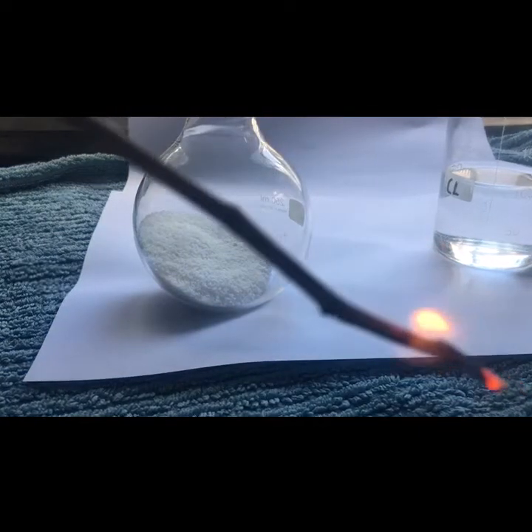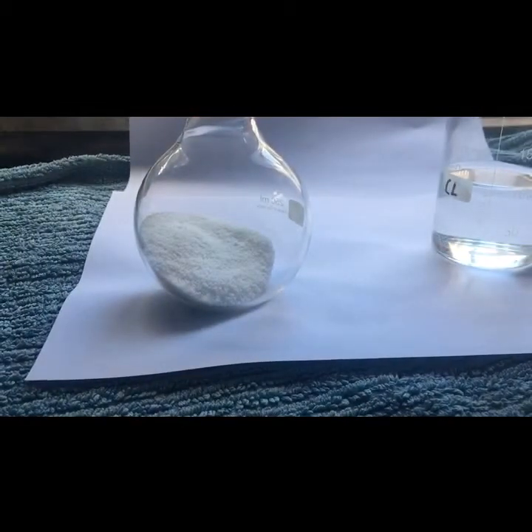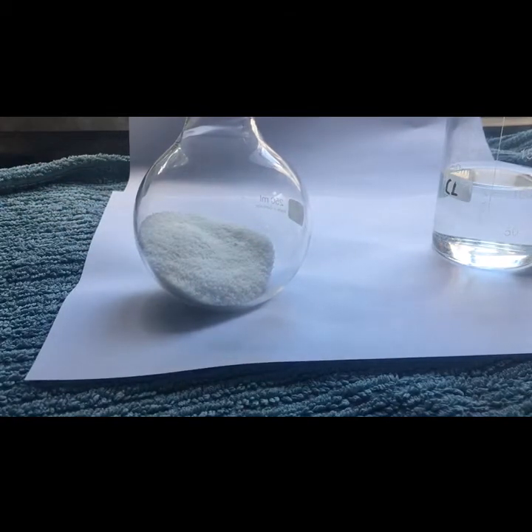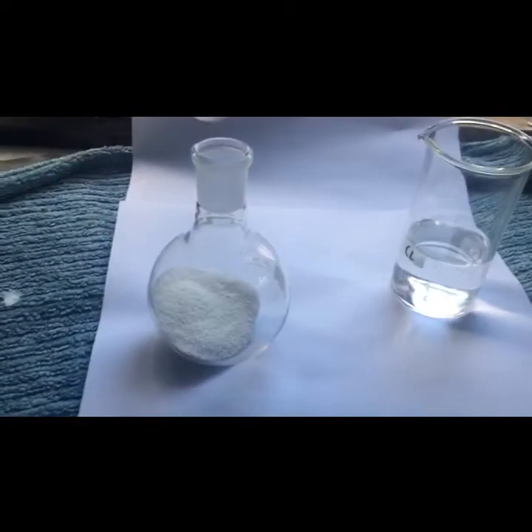Here's the burning stick, and now I'll put it inside the flask. As you can see, it immediately goes out. It dies down. I'll try that again. There we go, burning stick. I put it in and it immediately goes out. As you can see, it's reacting inside the flask right now. Now I've demonstrated that there's CO2 building up inside it.